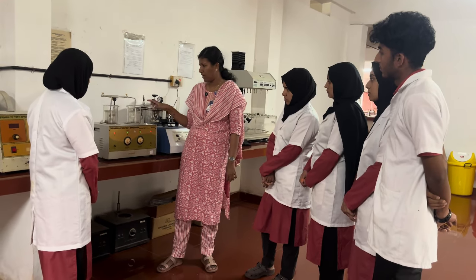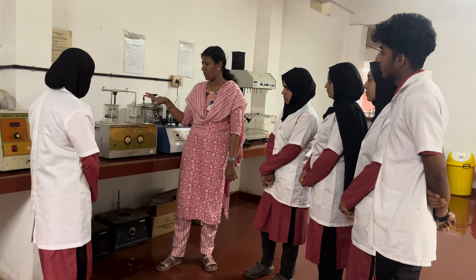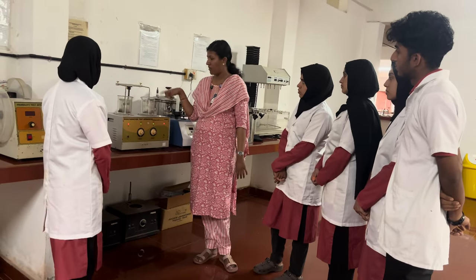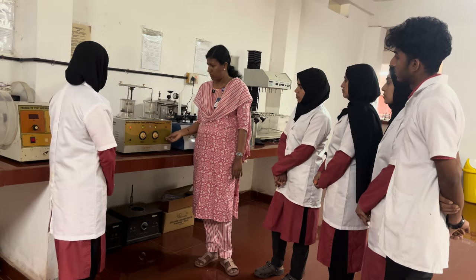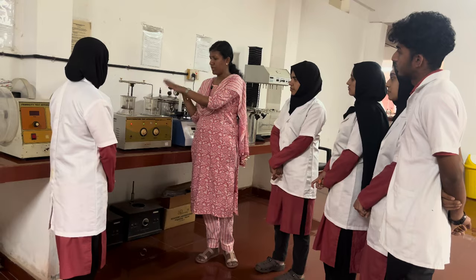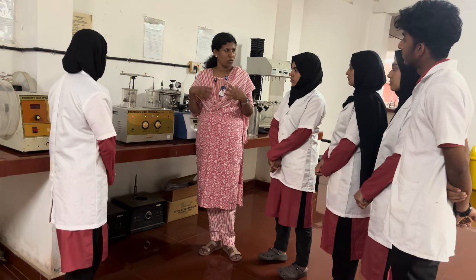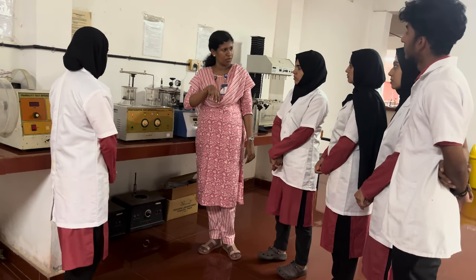Then it will have this upward and downward movement. Why are we doing this upward and downward movement? Why can we not simply place the tablet in the medium? Why are we moving this equipment? Because it is simulating the movement in our stomach. If you swallow a tablet, it will undergo similar movement.